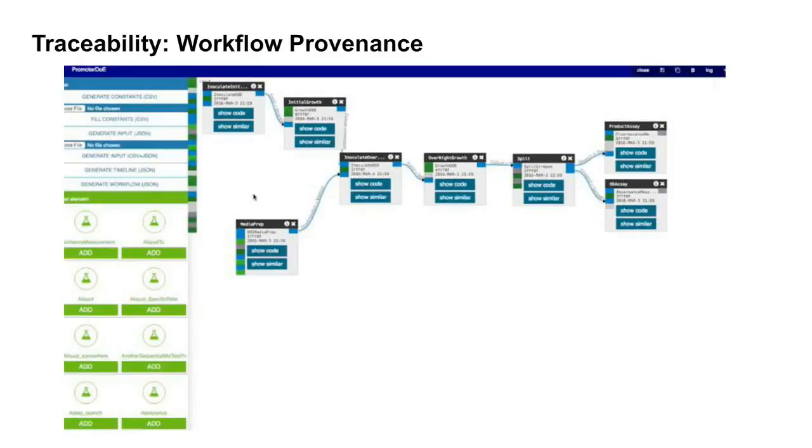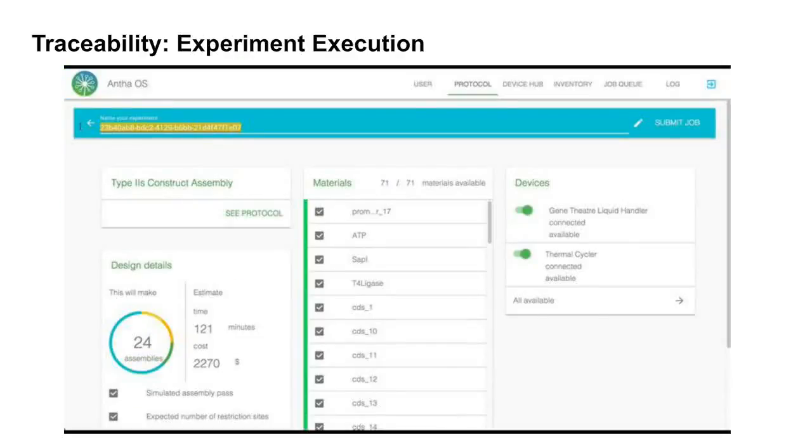So having defined a workflow, to be able to actually execute it successfully then, you need to pass in what are all the parameters that have been defined as empty within the workflow. And again, that means you can build visual tools to help you be assisted in planning, reasoning about, and executing your experiment. Again, the easiest way is to show that.